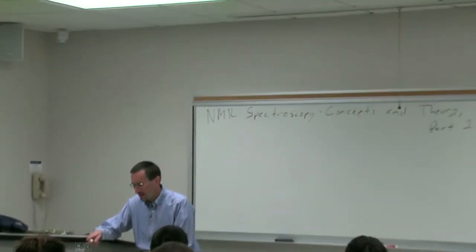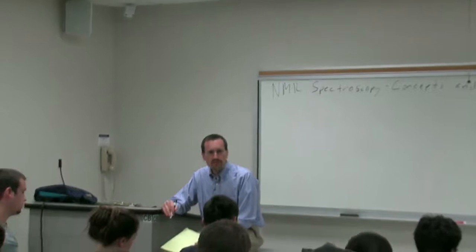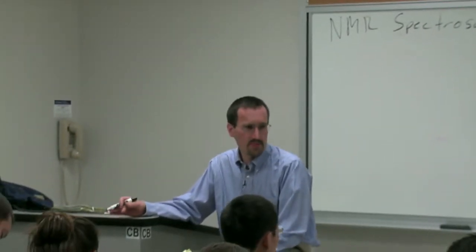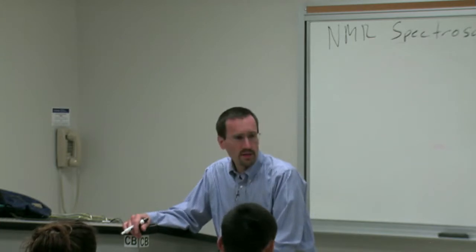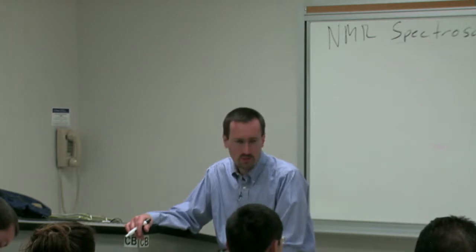All right. Well, what I'd like to do today and on Monday is to talk about NMR spectroscopy and kind of how NMR spectroscopy works. I'll call it concepts and theory. And for me, what I want to do is give my perspective on NMR, which is not a highly mathematical perspective. In fact, everything I write up here today, in terms of numbers, is going to be simple arithmetic, and most of it is more an embodiment of the idea rather than a specific calculation that you, quote, need to do.